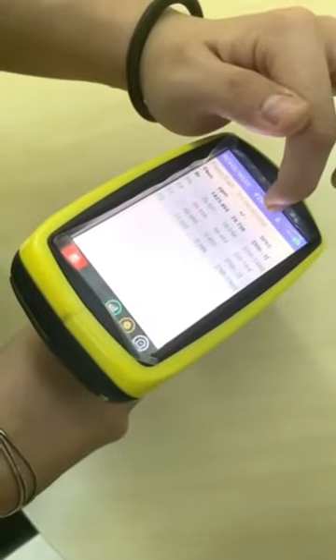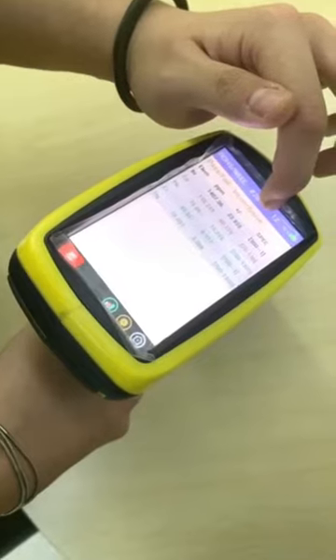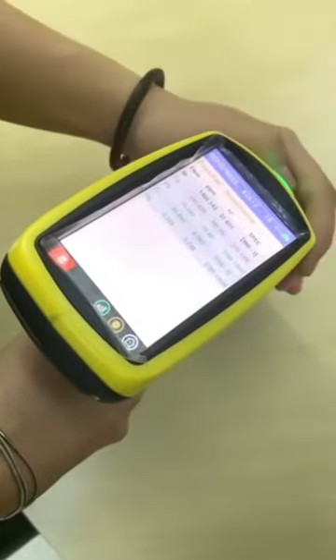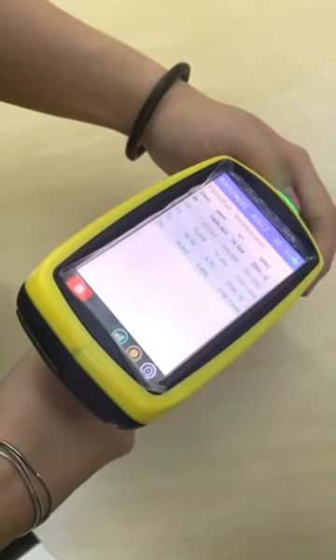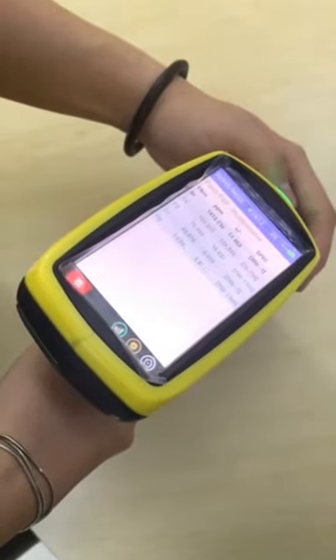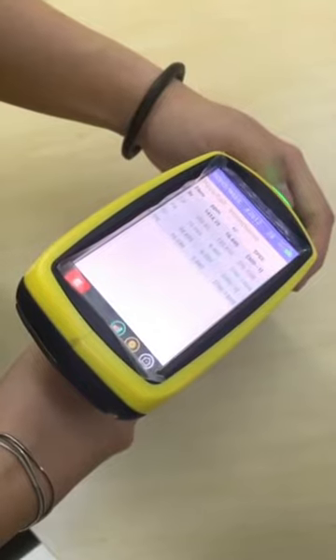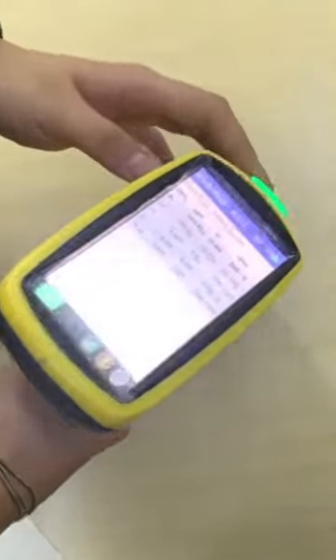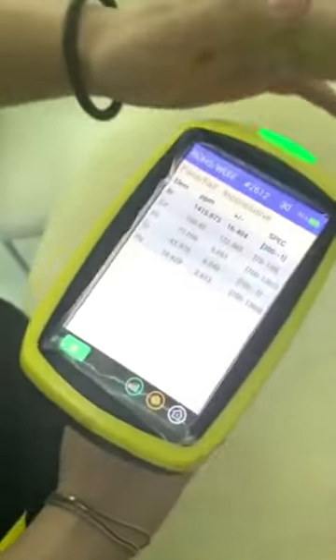This is our test time — 30 seconds is recommended. Okay, now you can see this is the result of the sample EC681M.